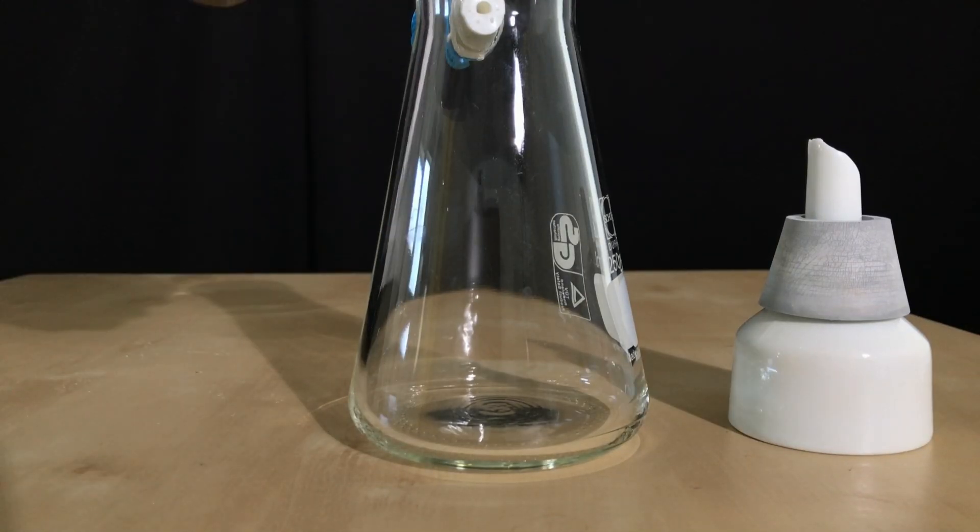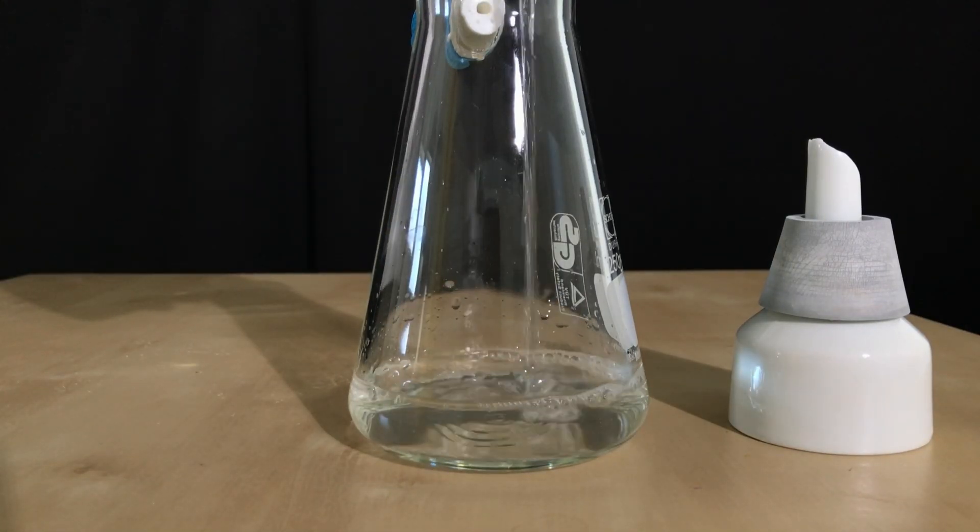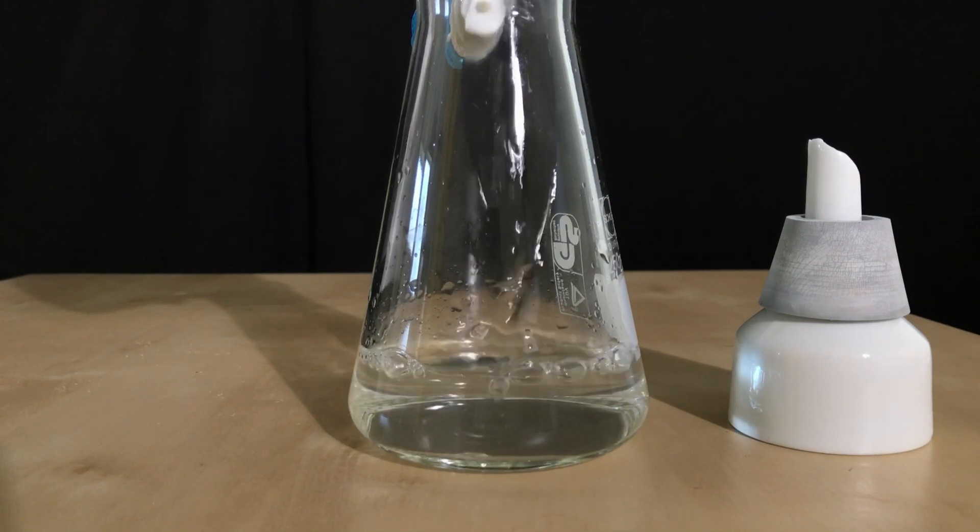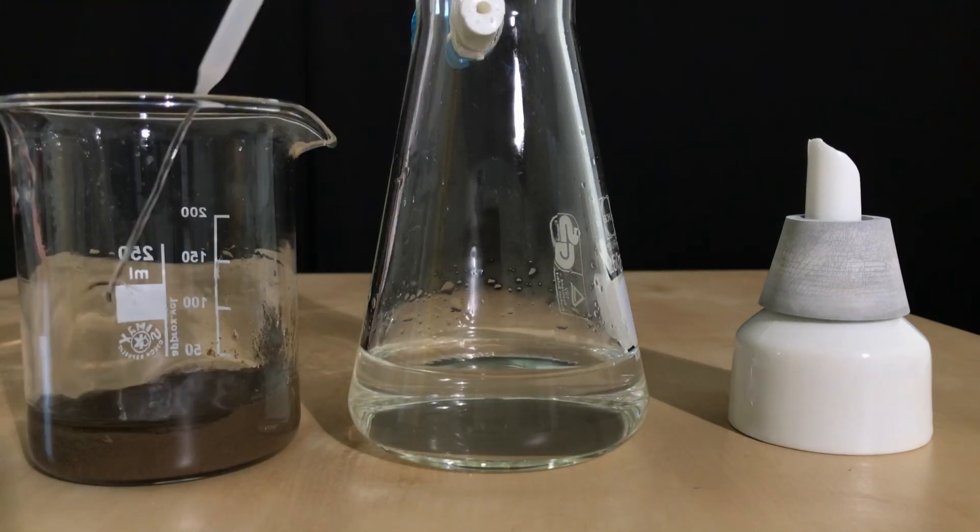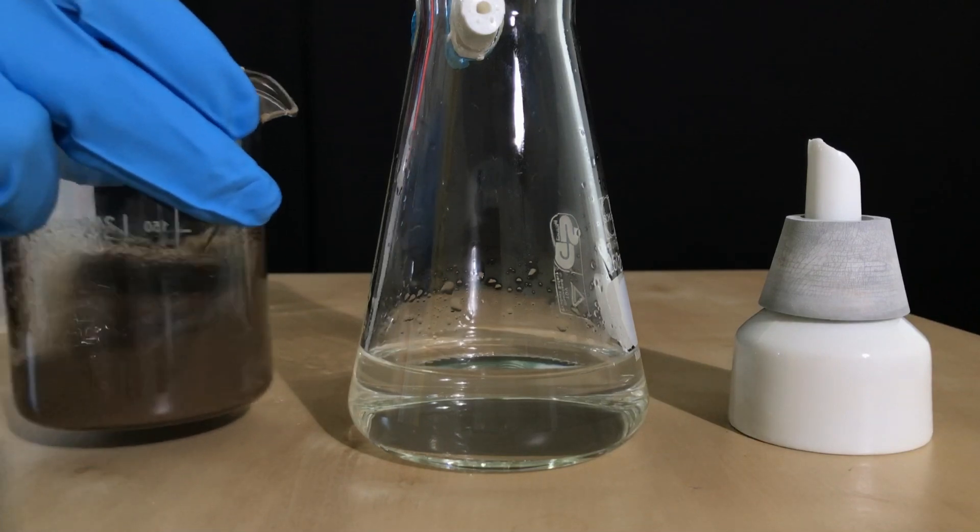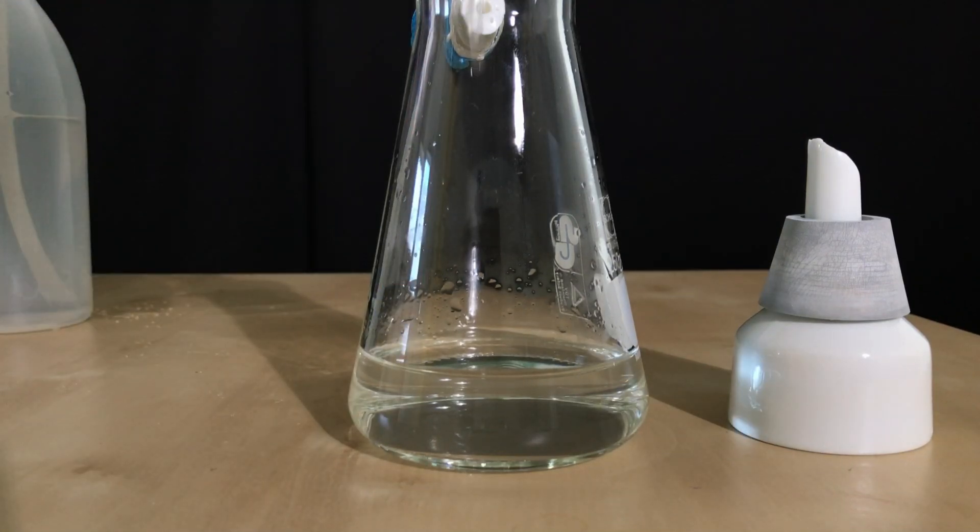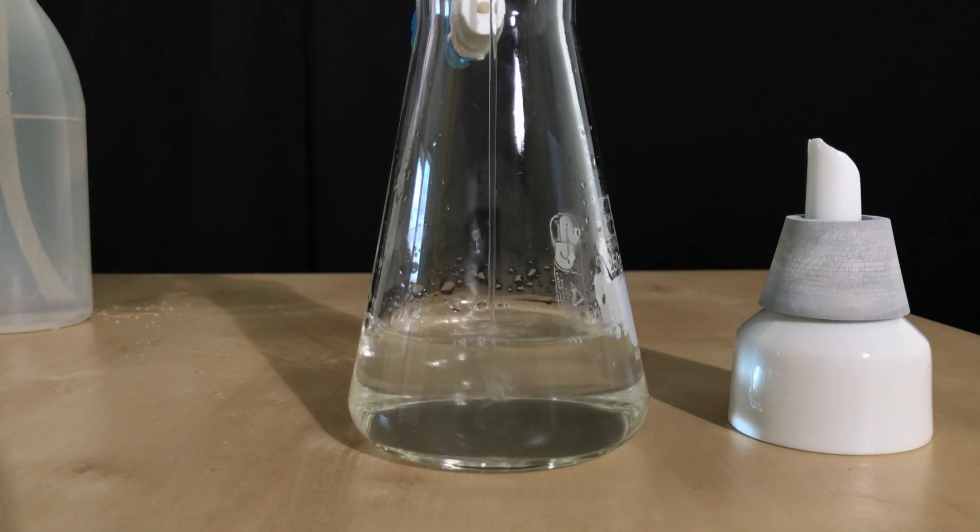As it settled down anyways, we can decant off the first part of the solution without having to filter it. This part of the solution should contain leftover sodium hydroxide and also sodium nitrate. To get rid of even more of the contaminants, the silver oxide was rinsed with a generous amount of distilled water.